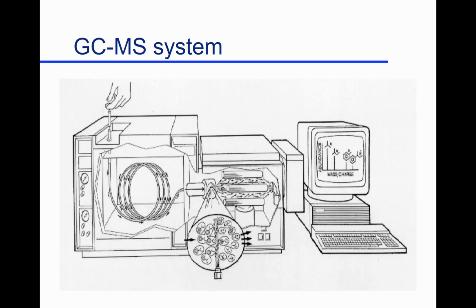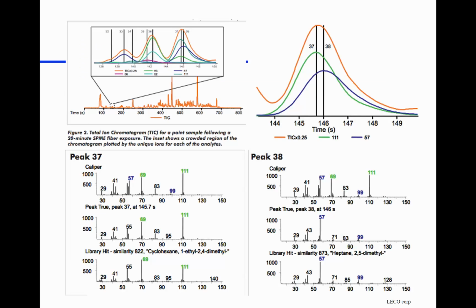Here's your capillary column fed directly into the mass spectrometer. It's fed into a quadrupole mass spectrometer. There's, of course, a detection system and ultimately a data handling system for it. I've shown you the top part of this figure before, and I don't remember if I presented the bottom. I guess you did see the bottom one also, yeah.